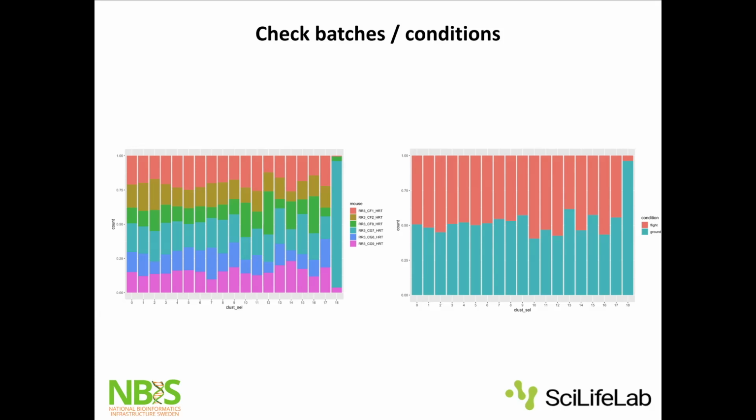But if it's like that, all the cells of that sample stand out on their own in their own cluster and it's behaving weird, then yes, I would consider removing it and then motivate that in the method section. So there's not one straight answer, of course. It's always a bit of exploring, going back, looking at marker genes for the clusters. Can I make sense of why only this sample has this cell type?